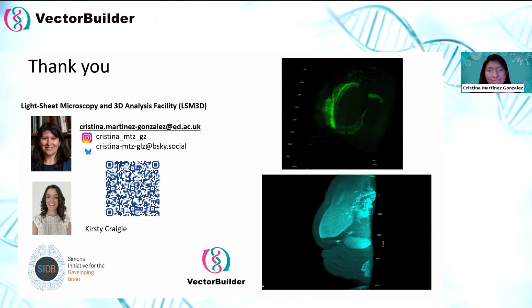Thank you. That was a lot of super helpful advice from one question. Awesome. The next question is, when using electricity to help quicken processing time of hydrogel-based tissue clearing, how do you overcome inconsistent or uneven clearing, especially in larger samples? I don't think there's a good solution for that. I've never been a huge advocate of that method myself. If you can, don't do the electricity. If you have the time, wait and use the passive one. If not, I would say change your clearing method. Move to water base if you want to, or solvent base.